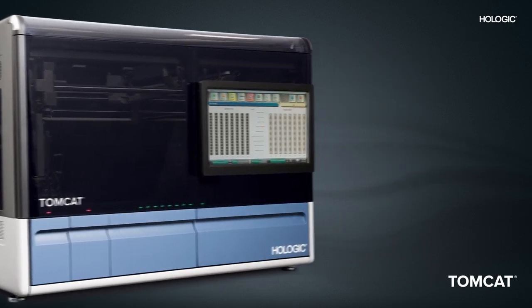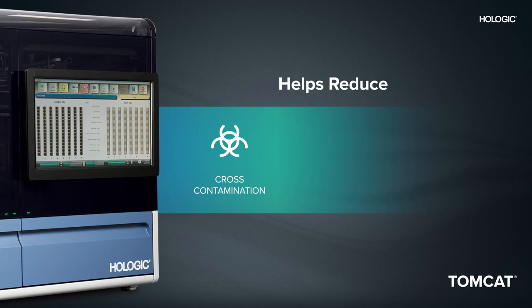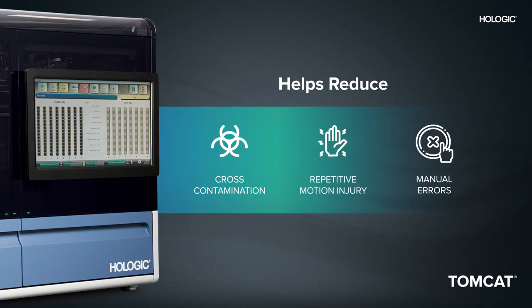The Tomcat instrument's elegant automation reduces risk of cross-contamination, repetitive motion injury, and manual errors, all while ensuring consistent aliquot volumes from tube to tube.